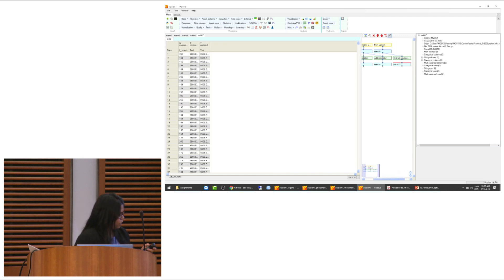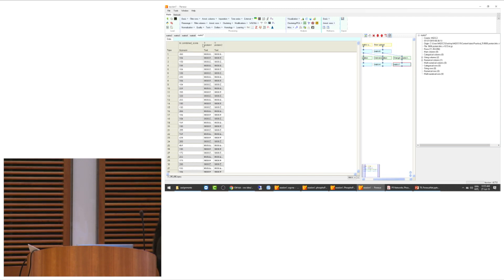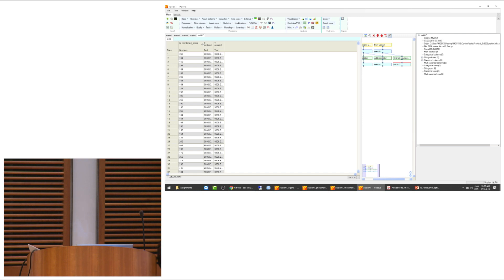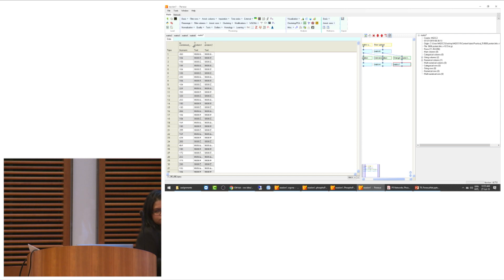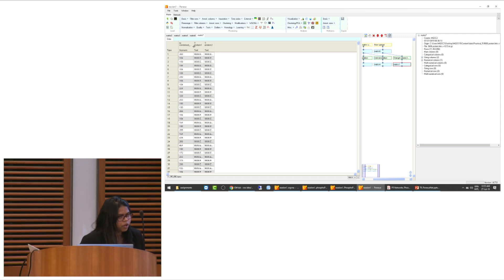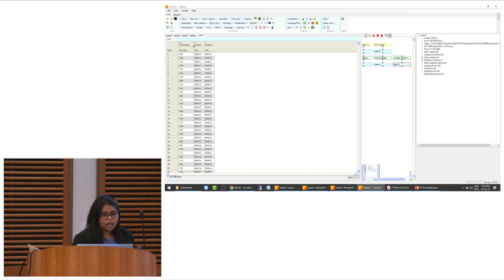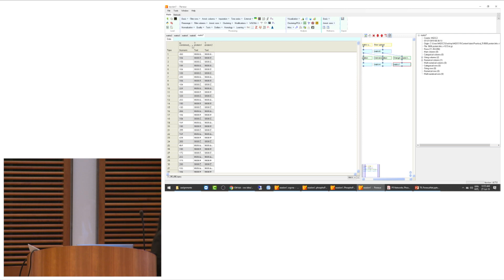Now you can see Protein 1 and Protein 2. Protein 1 is the first protein, and Protein 2 contains all the proteins interacting with it. The combined score gives the confidence of how confidently each pair is interacting. Because this was a raw upload, Perseus didn't know the data type, so everything is loaded as text.